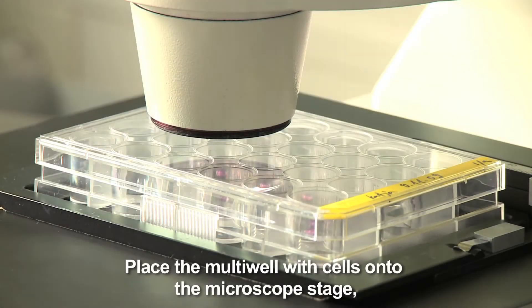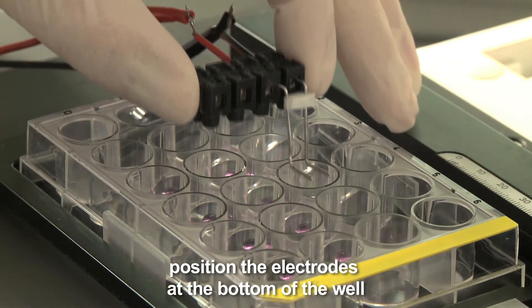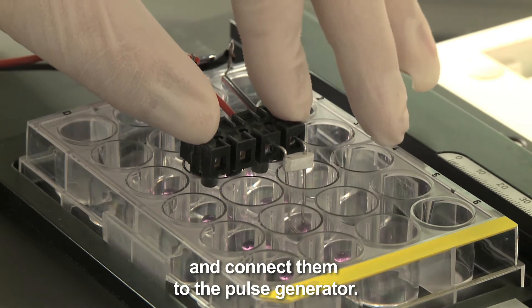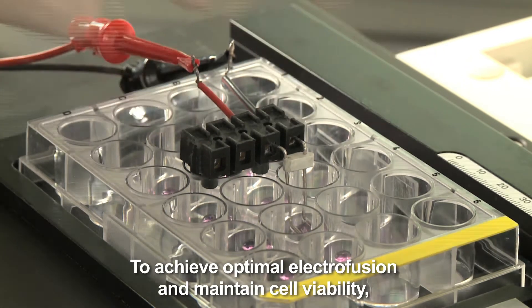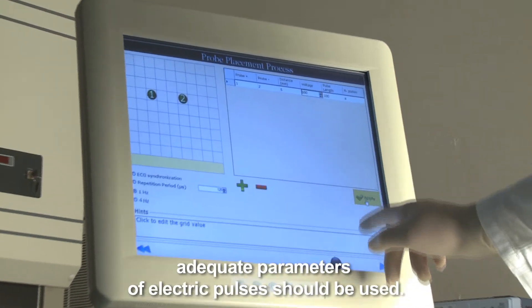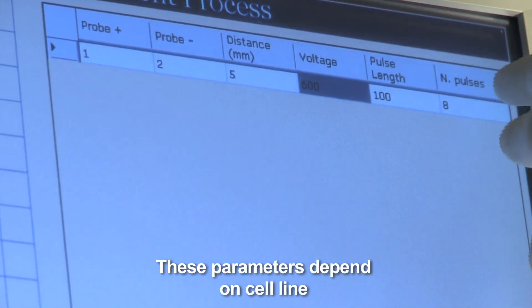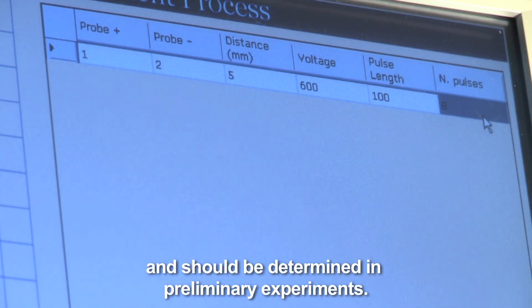Place the multiwell with cells onto the microscope stage. Position the electrodes at the bottom of the well and connect them to the pulse generator. To achieve optimal electrofusion and maintain cell viability, adequate parameters of electric pulses should be used. These parameters depend on cell line and should be determined in preliminary experiments.